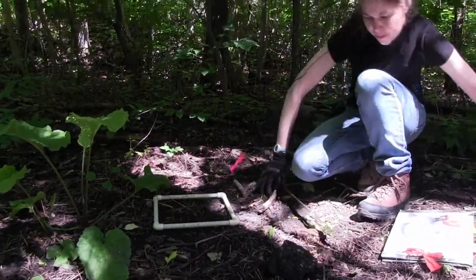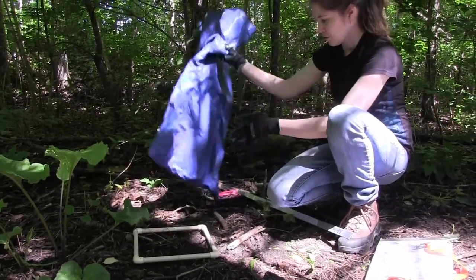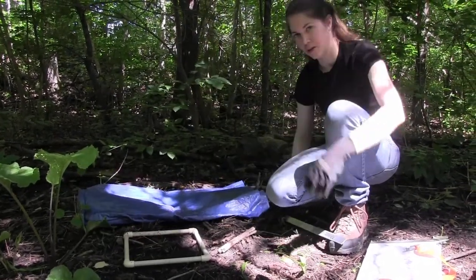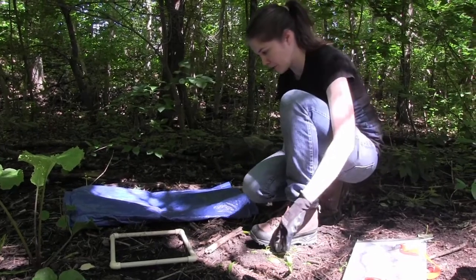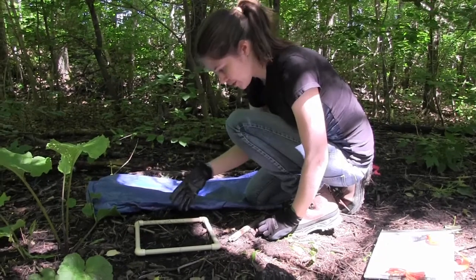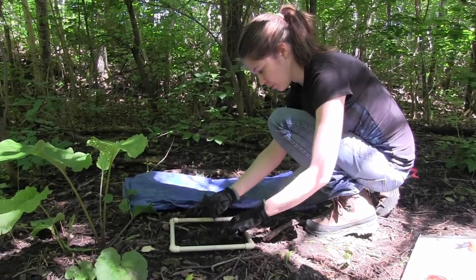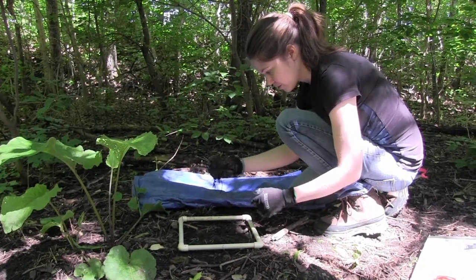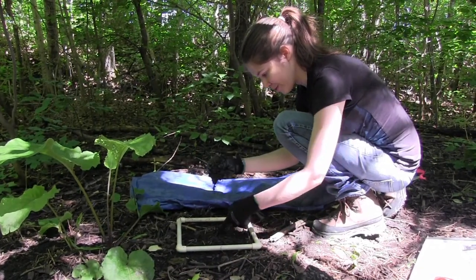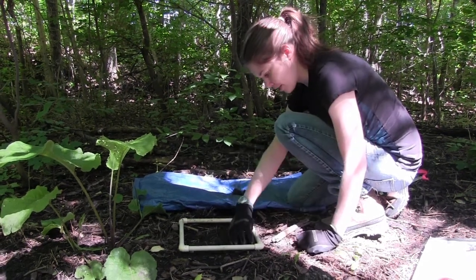The next step is to remove any leaf litter from the surface of the soil and sort through it, looking for earthworms and their eggs, which are called cocoons. In this case, there's not really leaf litter, so I just remove the loose soil at the top. So here I've taken off the top of the midden, and there's a hole where the earthworm lives below that.